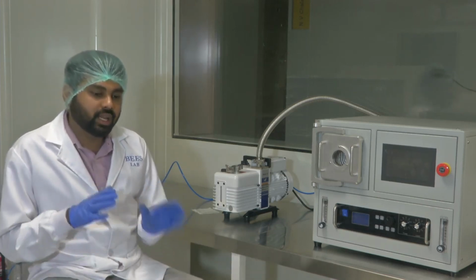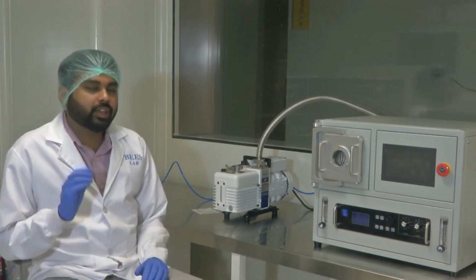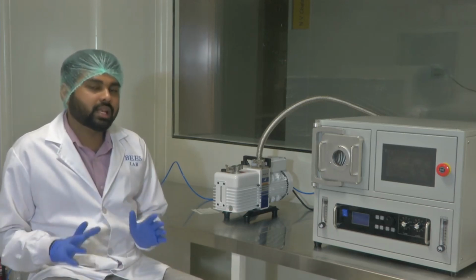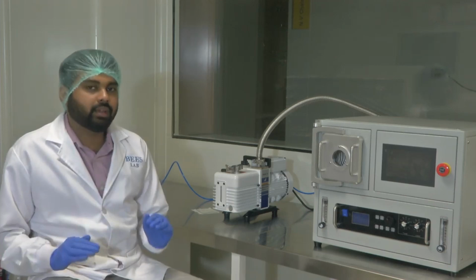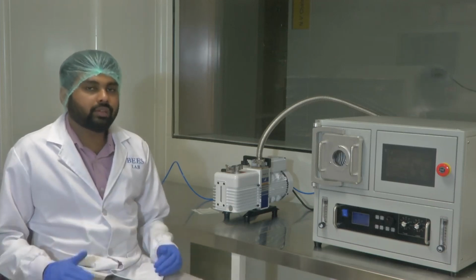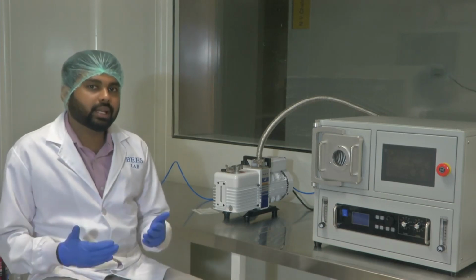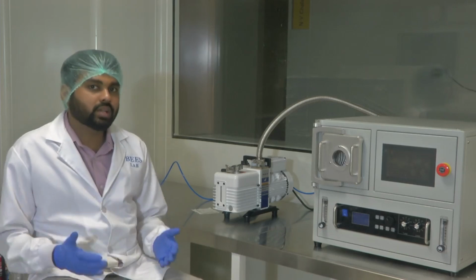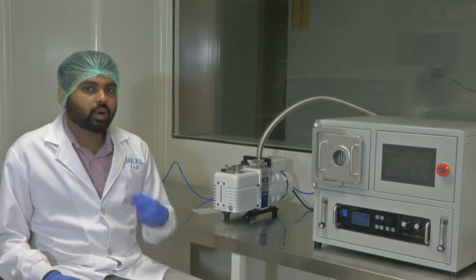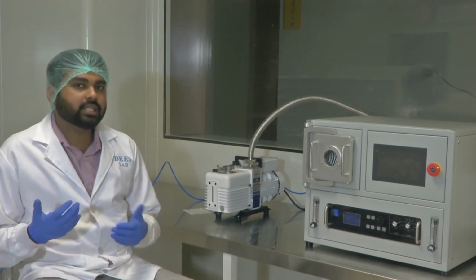Why do different materials have different colors? This is because, in a very crude way I will tell, there are a lot of processes happening that emit this color. But in a very simple way, if you break it down, I told you that we are applying high potential or RF energy to transfer that energy onto the oxygen molecules, the electrons in the oxygen molecule, right? So the electrons escape. It's a continuous process of giving energy, releasing energy.